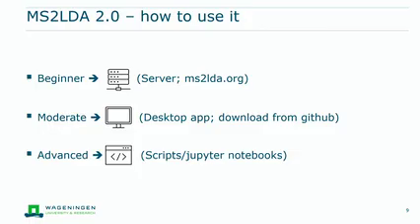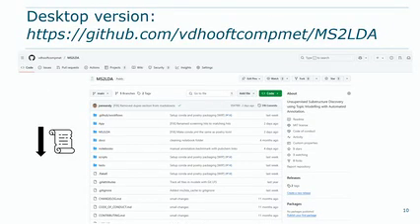If you have Python on your laptop, then the first thing to do is please go to this GitHub repository. Yes? These slides, can we download them somewhere? We can share them afterwards. But it'd be nice to copy paste the links. Yeah, that's a fair point.